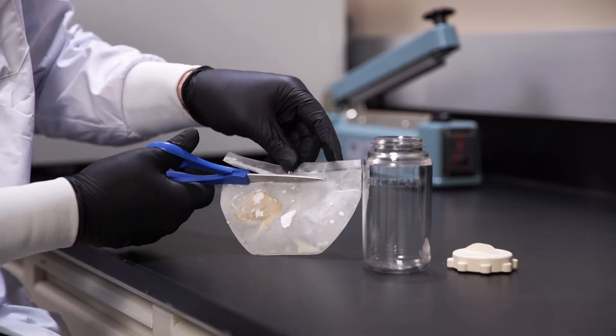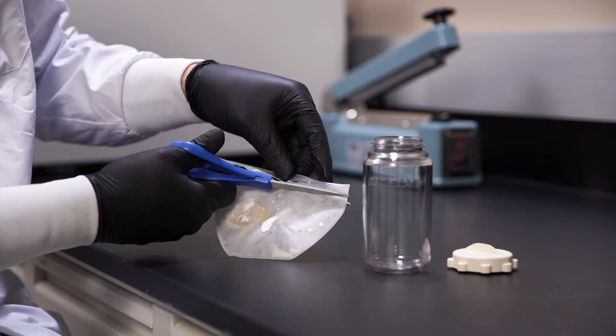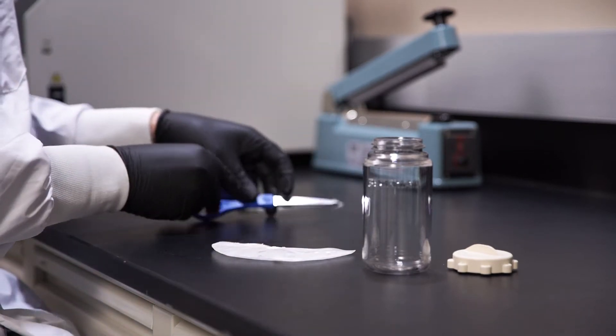If your workflow requires freezing, pellets can be contained in heat-sealed liners and frozen for storage and later processing.